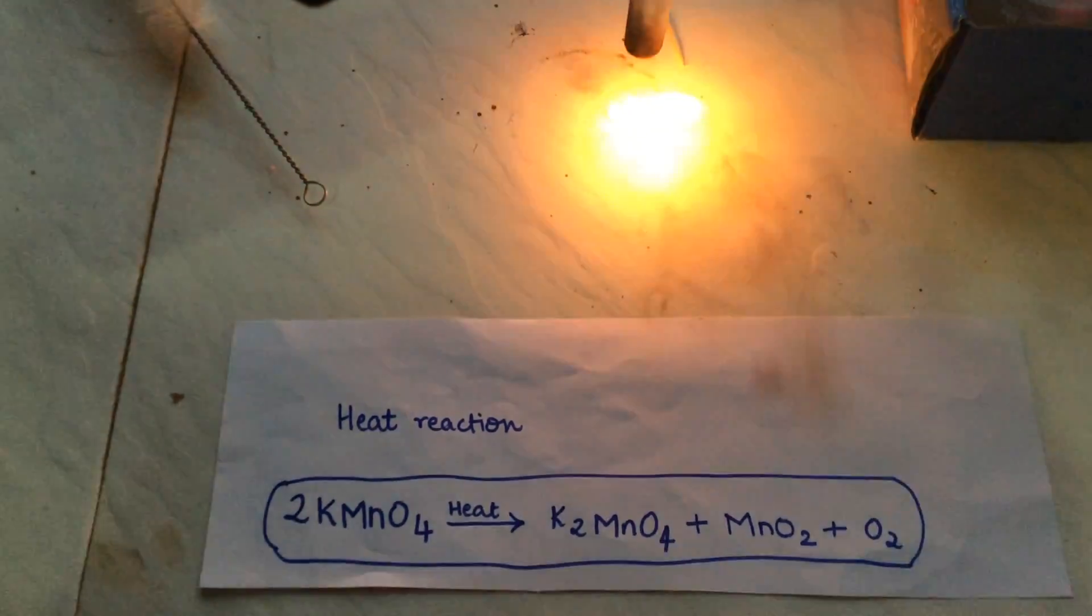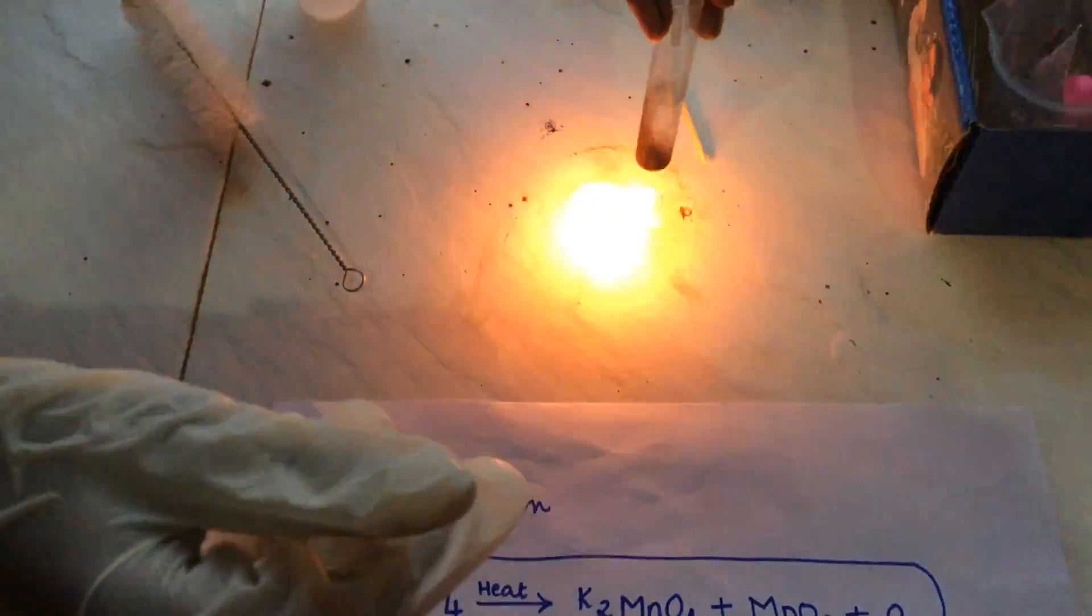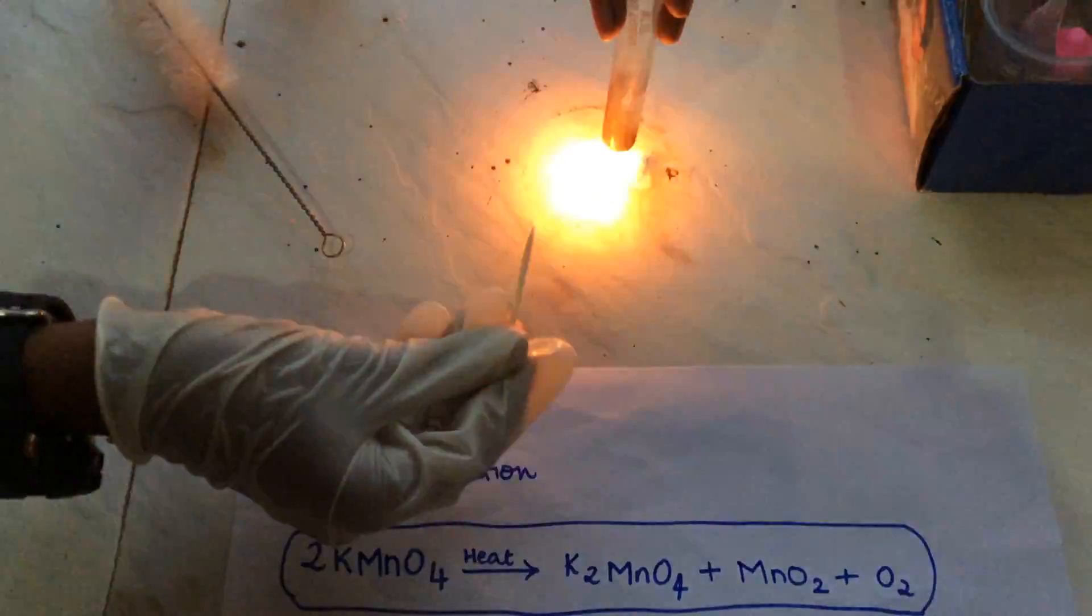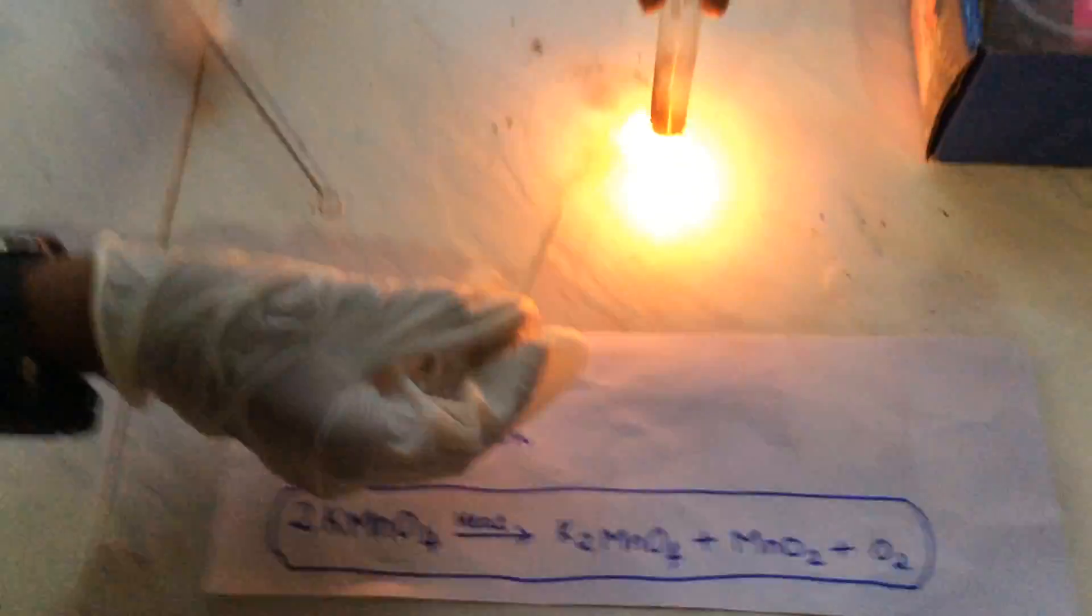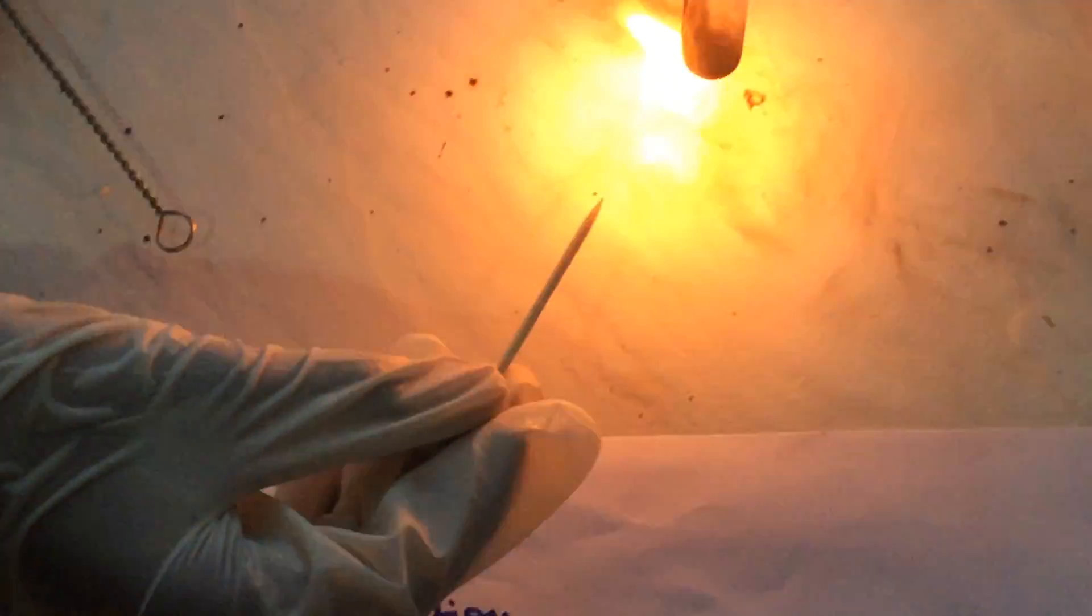Hold the test tube in a test tube holder and hold it over the flame. Very soon oxygen gas will be released. Light a toothpick and when its flame is small, bring the lit end to the mouth of the test tube. We are doing this with the help of a match stick here.